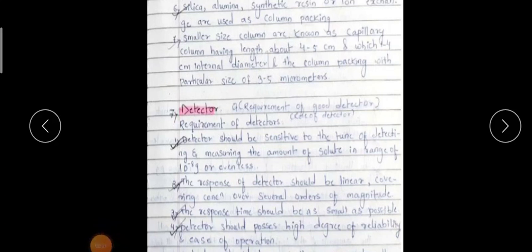Good morning, friends. In the last lecture, we discussed the components of the HPLC, high performance liquid chromatography. In that, we talked about these particular things. The first step was the solvent reservoir, then the degassing system.